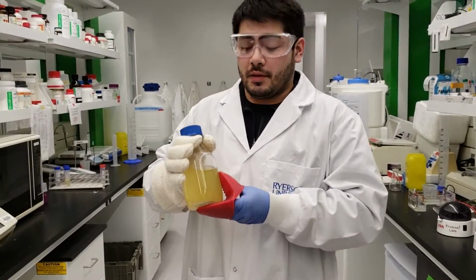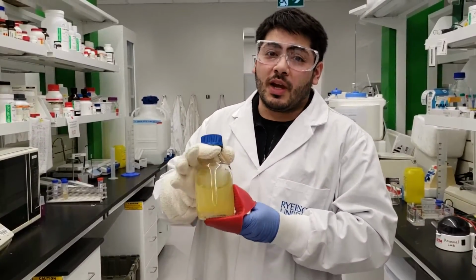So once your lunch break is over and the autoclave process is done, the agar is going to come out extremely hot, so we have to let it sit for a little bit to cool.